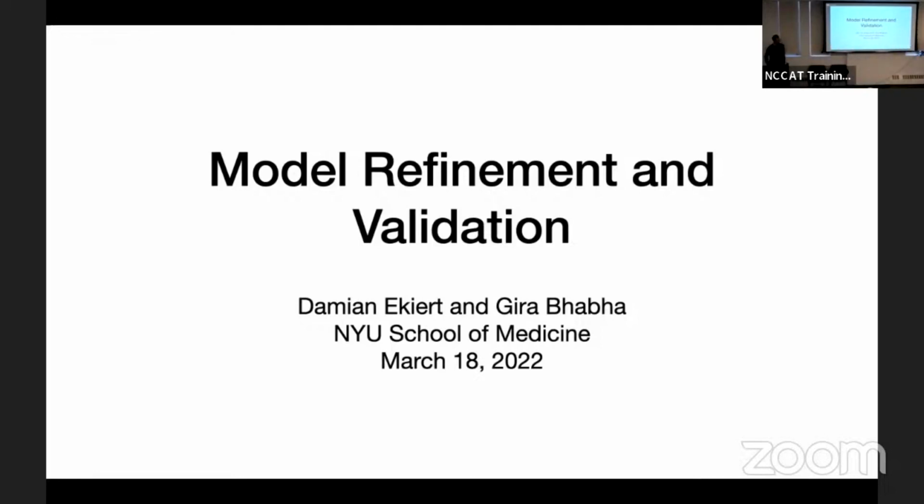All right. I think I got the mic on screen. So really, going hand in hand with what Ollie's been talking about, the actual building of your model, there are also these two other really important parts of the process: the refinement of your model and validation of your model. And I think you should not be thinking of these three things as three separate processes, but three things that are all intermingled together, something you cycle through over and over again. Validation in particular, some people think it's something you do at the end, but it's really something that's done after each round of model building and refinement, by running your model through some validation programs and identifying the problematic areas.